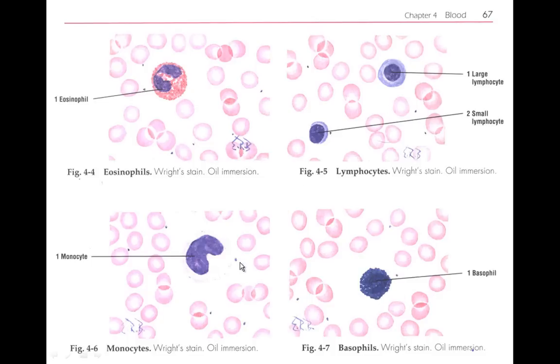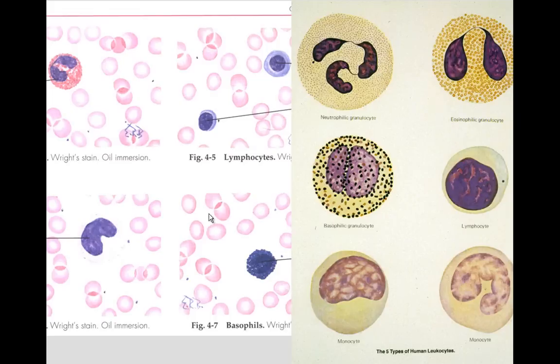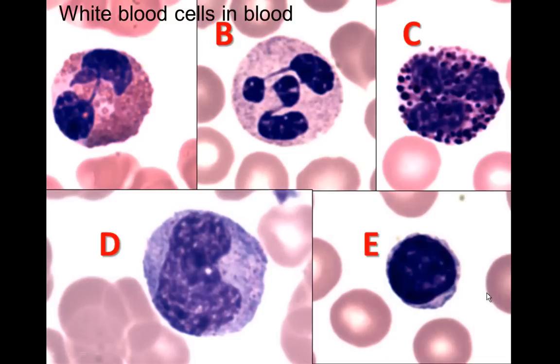The granules of the basophil are actually above the nucleus, impeding a clear view of it. We also see monocytes — a monocyte is a blood cell that eventually becomes a macrophage. At higher magnification in the drawing, we see the neutrophil with granules and a lobulated nucleus, eosinophil with big granules, basophil with big blue granules above the nucleus, lymphocyte, and monocytes.